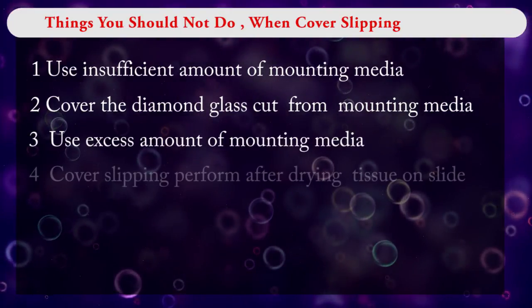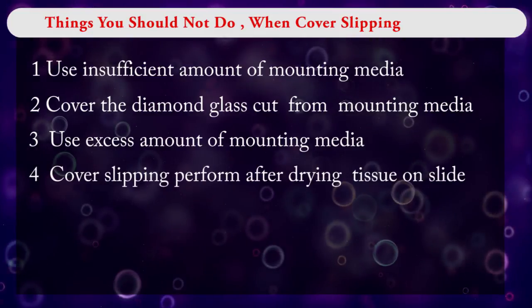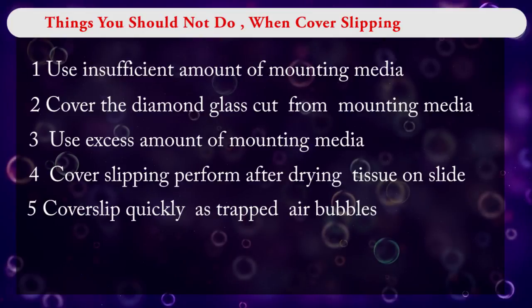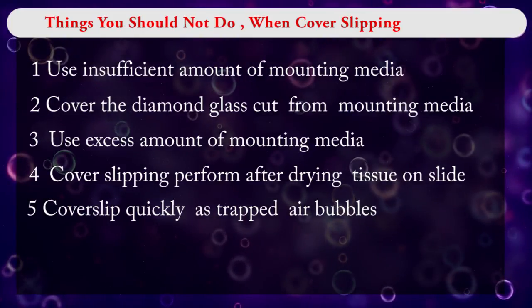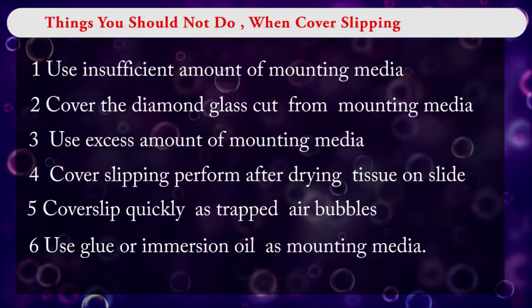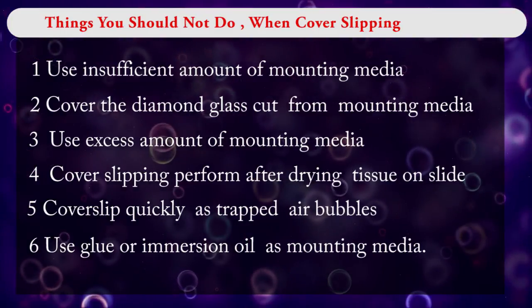Do not perform cover slipping after the tissue on the slide has dried. Do not quickly put the cover slip on the mounting media, as this traps air bubbles under the cover slip. Do not use improper labeling glue or immersion oil as mounting media.